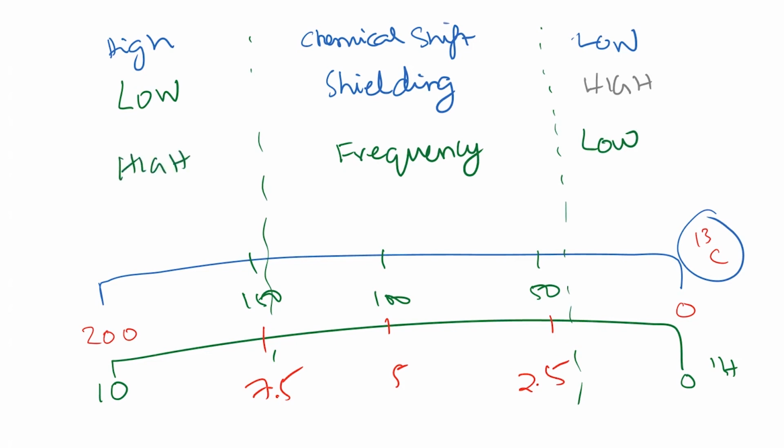You need to understand these terms a little better, because they will come back again and again. So, I will repeat: something that has a low chemical shift is usually highly shielded and resonates at a low frequency. There are also other terms, called upfield and downfield, which I am not going to really use. We will avoid those terms in this lecture.